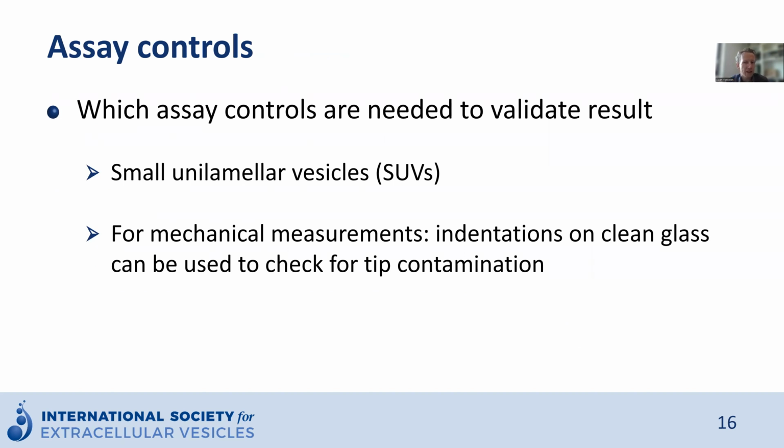In terms of assay controls, currently no broad standards are used as a reference. If you are getting started with AFM, I can strongly recommend to also perform some experiments on small artificial unilamellar vesicles, or SUVs, of a known composition and a known size. This would be a good starting point and reference to use.